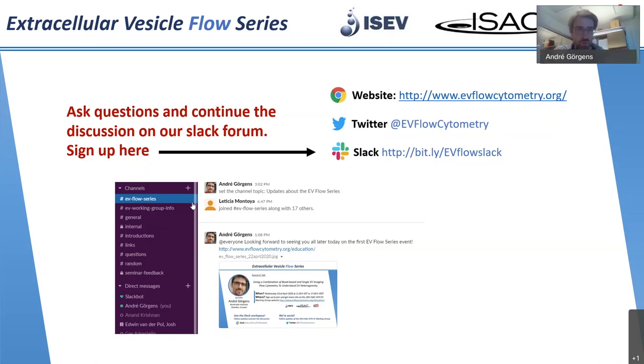your sample of interest with the beads, incubate that and stain it with your detection antibody of interest. And of course, you do the same thing without EVs being present. So that lets us see some amount of background that is just coming from false positive binding. And that is normally quite low. In some cases, as mentioned for body fluids, it's rather high, but then you at least would know some kind of that background.